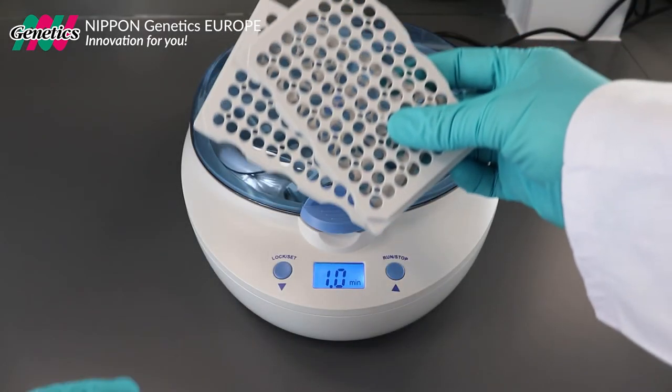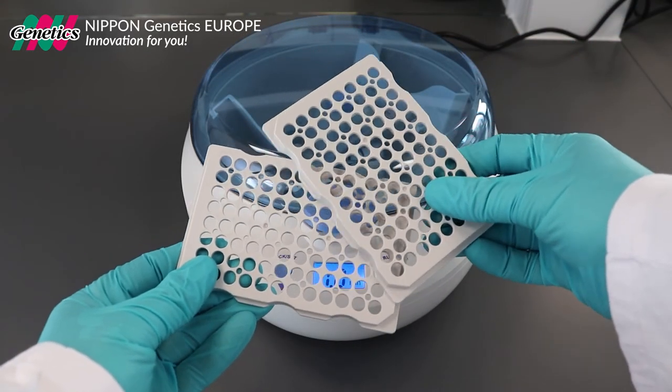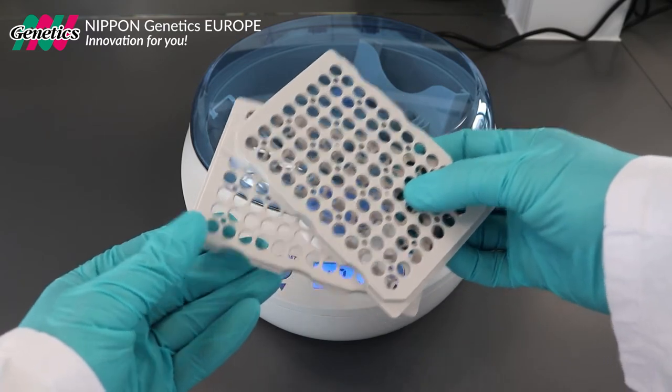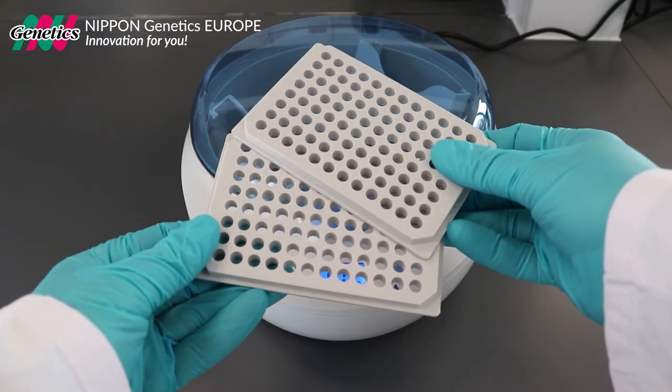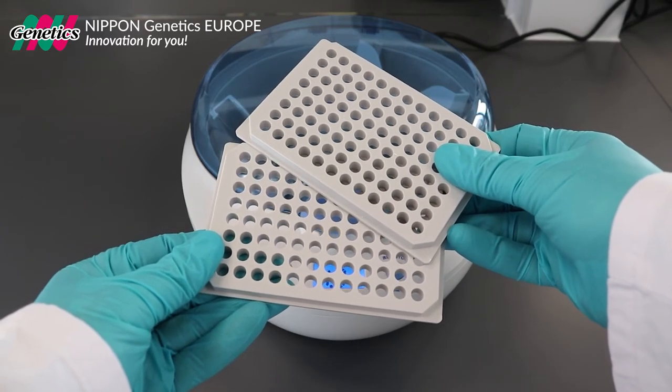Included in the package are two sets of adapter plates to centrifuge all sorts of different plates and reaction tubes, such as half or non-skirted plates as well as single reaction tubes.